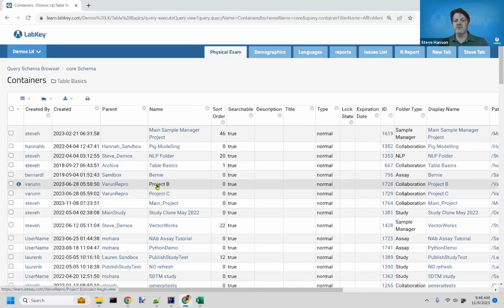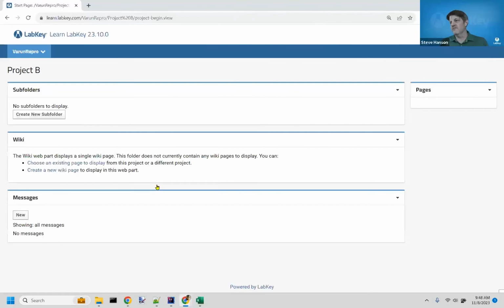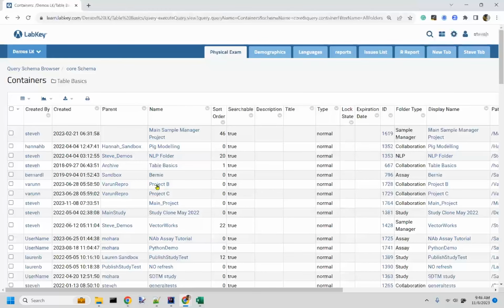If I want to go to project, what's this project B? What's that? Whatever that is. Good question.